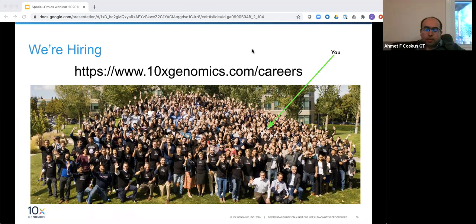So I was impressed, actually, a quick question here, with your permeabilization thinking. I think that's a nice way of looking at optimization, right? Currently in our cell culture protocol, we just say, okay, keep it this long, keep it this much, right? We don't necessarily optimize per tissue in general. And would you also consider the same thing for a fixation process? Because I remember one of my students got a PhD qual question, how are you going to preserve the most amount of proteins or other stuff in the cell by optimizing fixation chemistry, right?